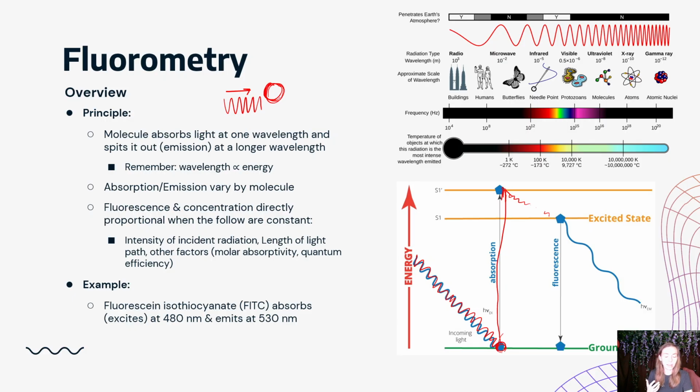Gravity. And then a couple of seconds later, well, not necessarily a couple of seconds, after it loses a little bit of that energy, after that moment of like I've just been hit by something, calms down, after the energy dissipates a little bit, it then kind of is like, actually, I don't want this energy. This is bad. This is not for me. And it spits the energy back out. Because the energy has lost a little bit of its level, the energy spits out at a longer wavelength. Okay? So this is in, this is what we hit it with, this is out, this is what it gives us back.